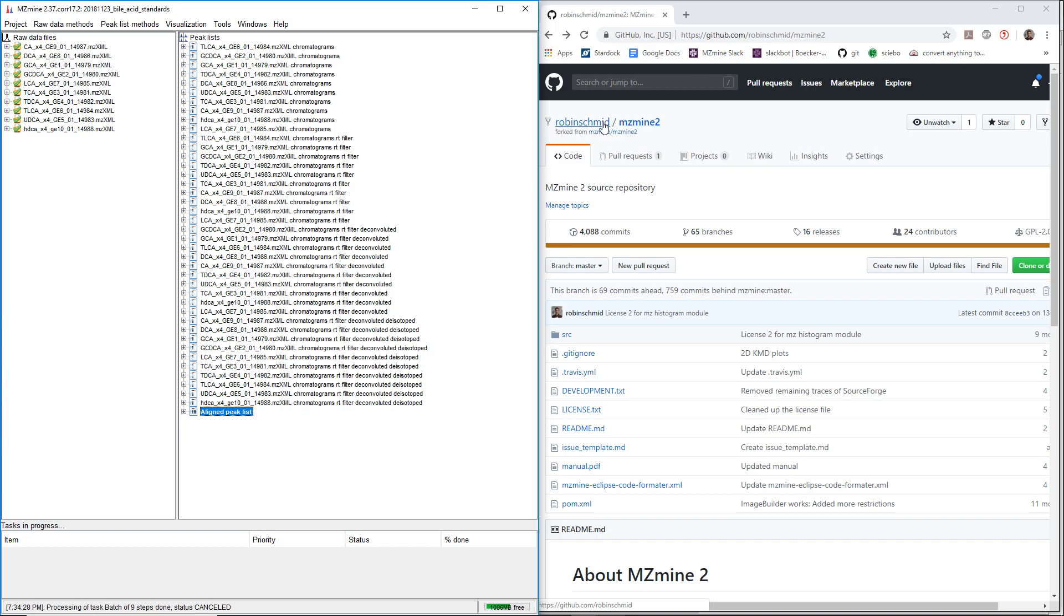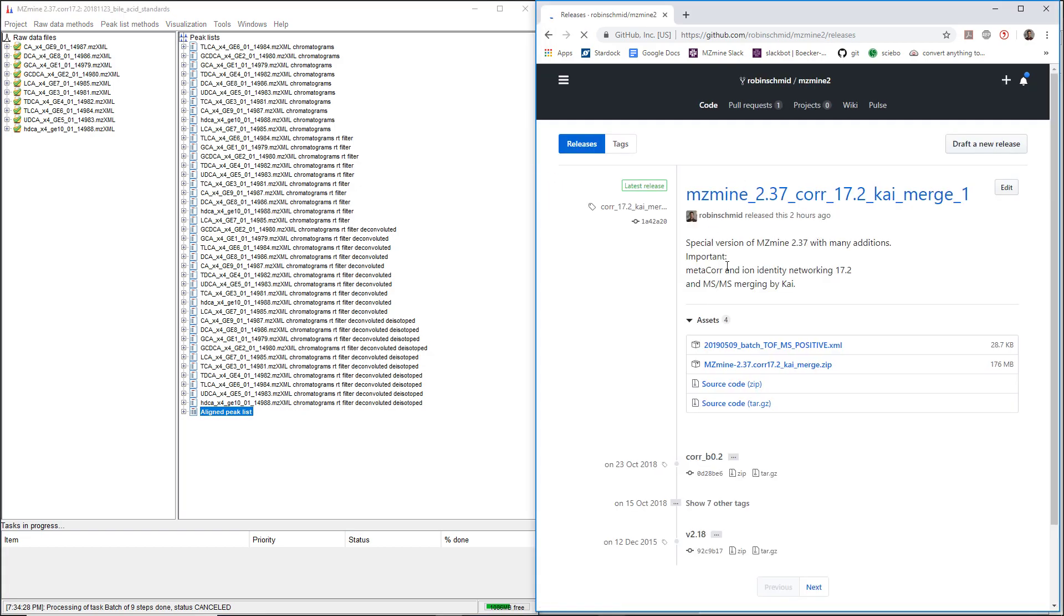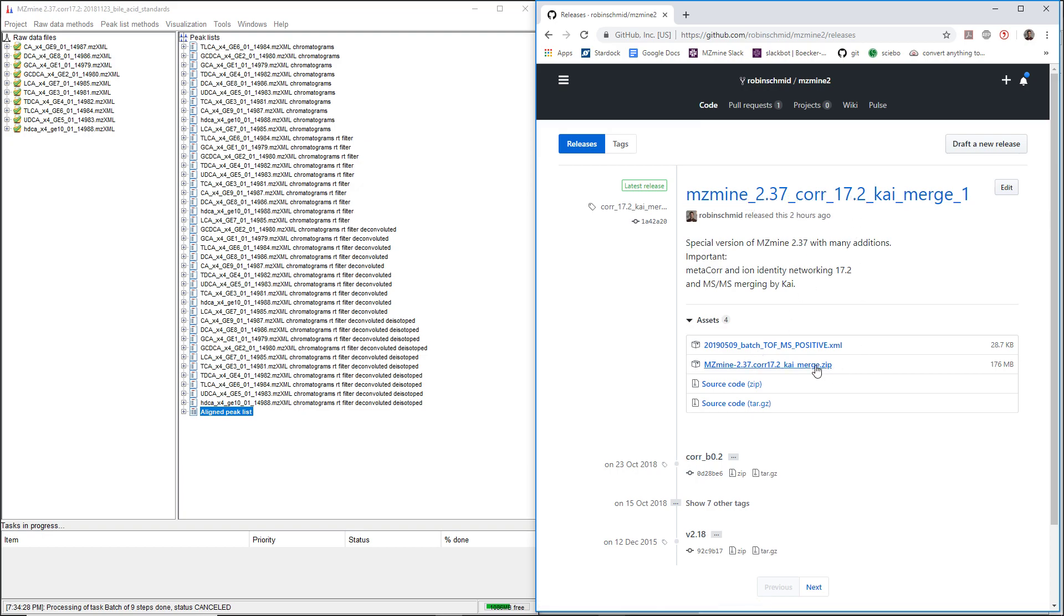You just go to Robin Schmidt mzmine2 on GitHub, and then under Releases, you're going to be redirected to the release page. Here you're going to be able to download the latest version, so you just download the zip file here.